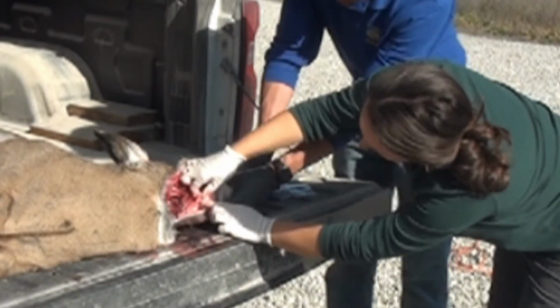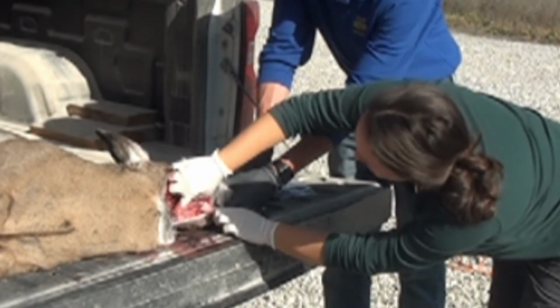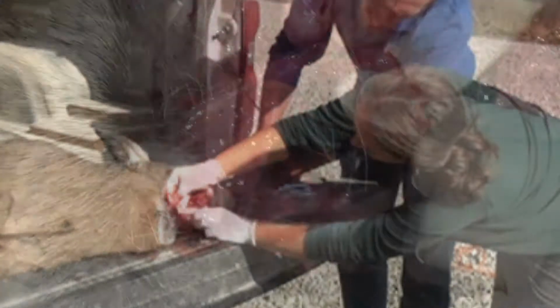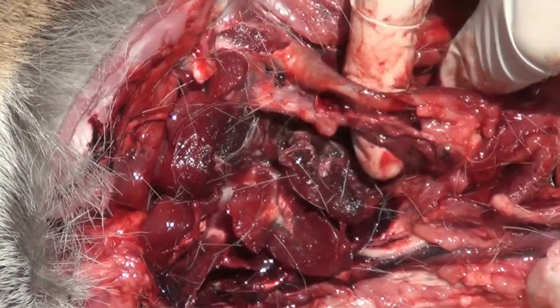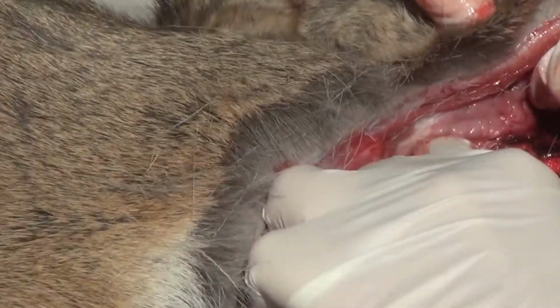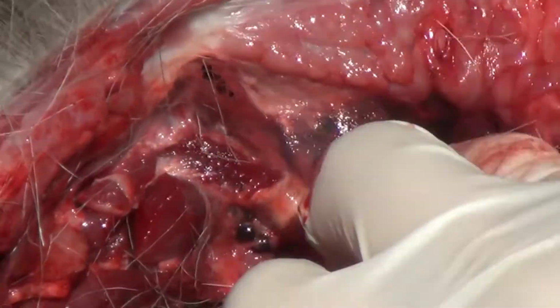So I have a lymph node right here that's pretty small. I would expect in a buck this size for it to be bigger, but once we probe around a little bit, it might be that that's actually our lymph node. There's another lymph node here. This is looking closer to the size I would expect. So things may have gotten repositioned with the roadkill. Here's a little bit more of that fluffy salivary gland tissue.